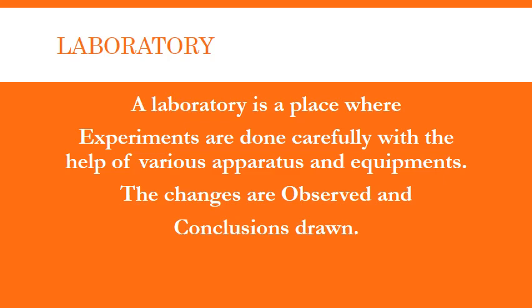So you will use various apparatus, like when you were testing whether an ice cube melts or not, you kept the ice cube in a plate. Now the question is, if you keep one ice cube in a glass and one ice cube in a tray, will both the ice cubes take the same time to melt? So find it out. Do this experiment and find it out. Record the time taken. Then you have done an experiment out here. And whatever changes you observe, you record those changes.